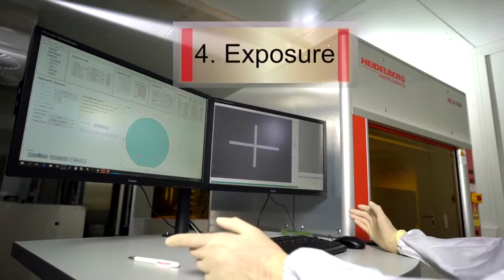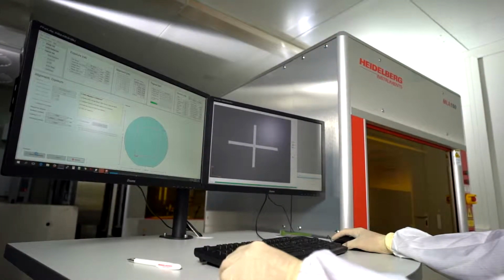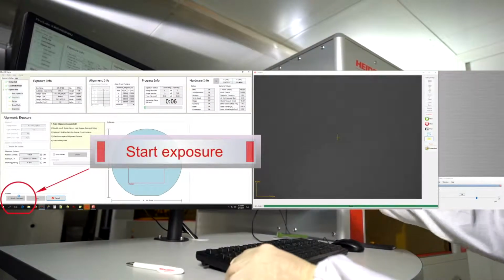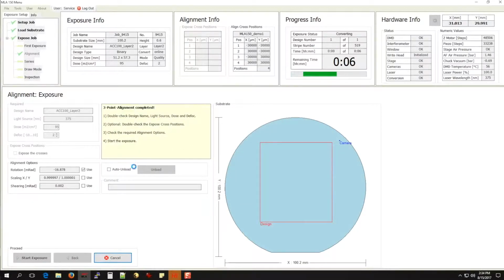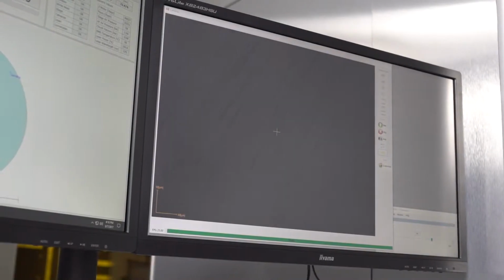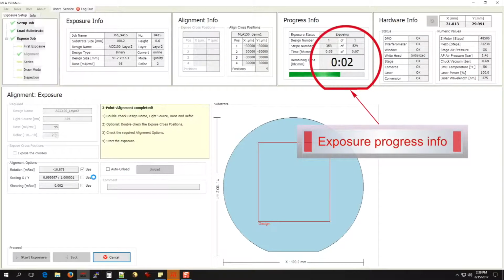Now for step 4. After checking dose and focus values, adjusting them if necessary, you're ready to start the exposure. The system calculates the estimated exposure time. The progress and status are displayed on the monitor at any time. In our case, it only takes a few minutes to complete the writing of the designed layer.